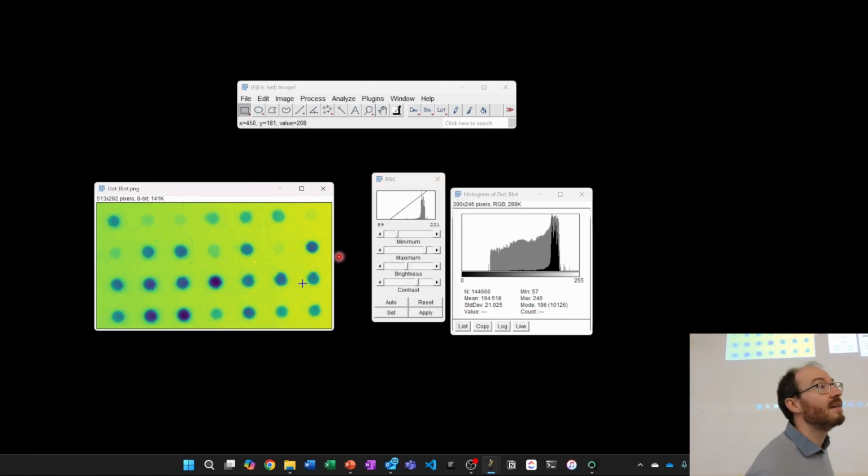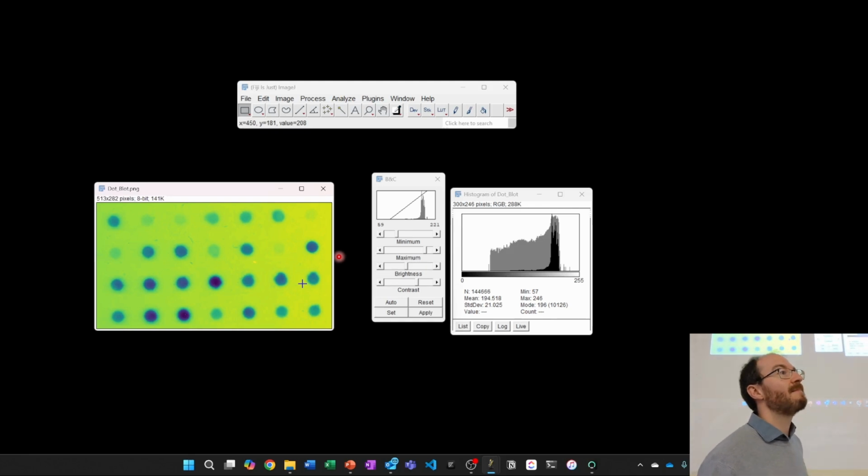So by altering that, you want to alter the pixel intensity? Exactly. You can play around, and the pattern of values will be exactly the same. If you click Apply here, that's a dangerous button. Then it will actually change your intensities. Generally, don't click that button. There are very few cases where in an analysis it makes sense.